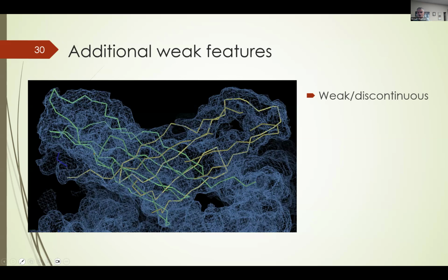I was playing with an AlphaFold 3 model of the receptor, searching for consistency with some prior cross-linking data. I found that by bending the interdomain linker by about 90 degrees, one of the beta strands of PKD1 passed through several of the stronger features of this disordered density. Then, with dihedral rotation of the domain, I found that I could rotate a second strand into some density, and then a third, and so on.